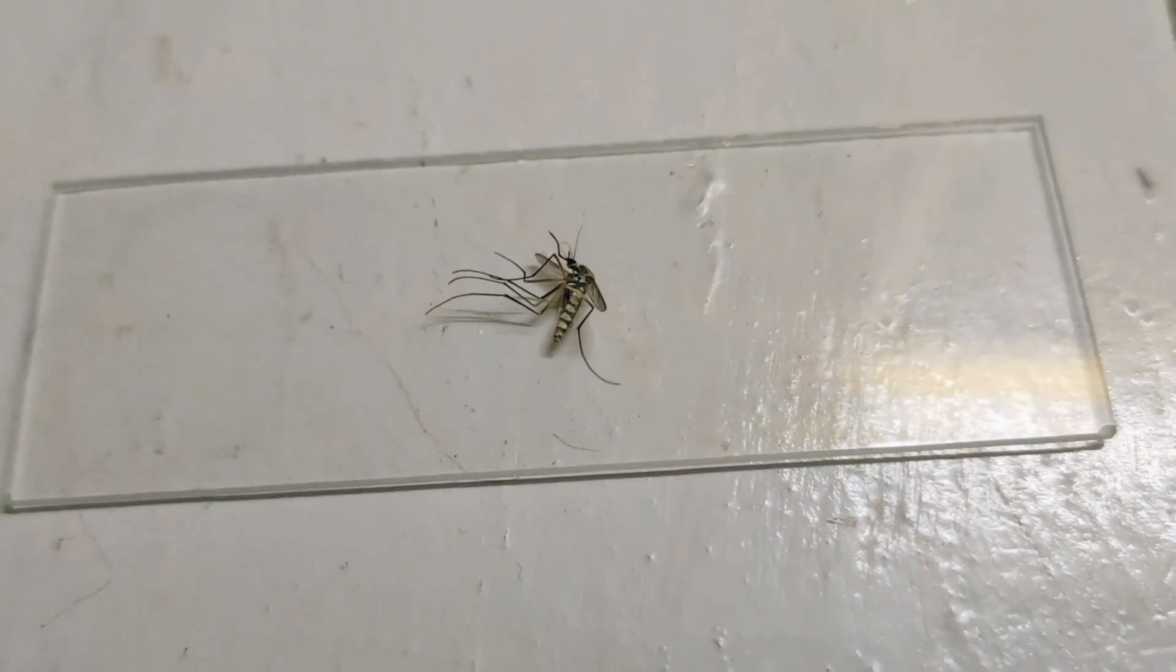This looks huge, but it's one little grain of sugar. Everyone knew this, let's put it under the microscope.